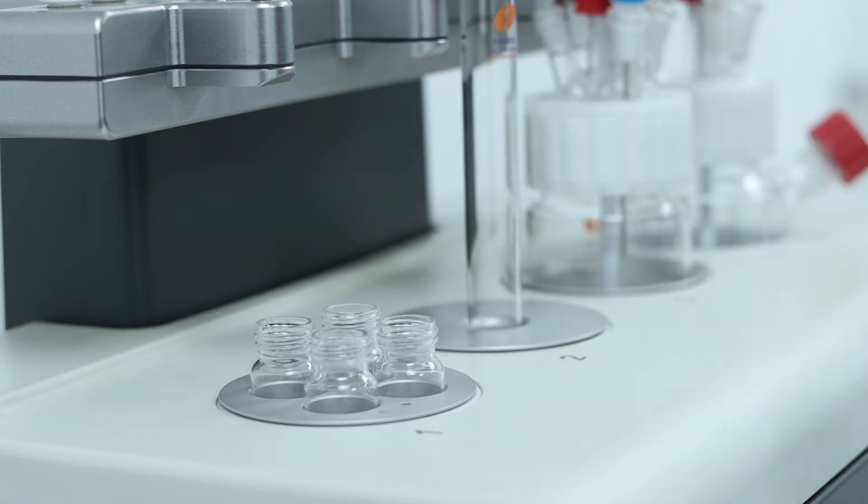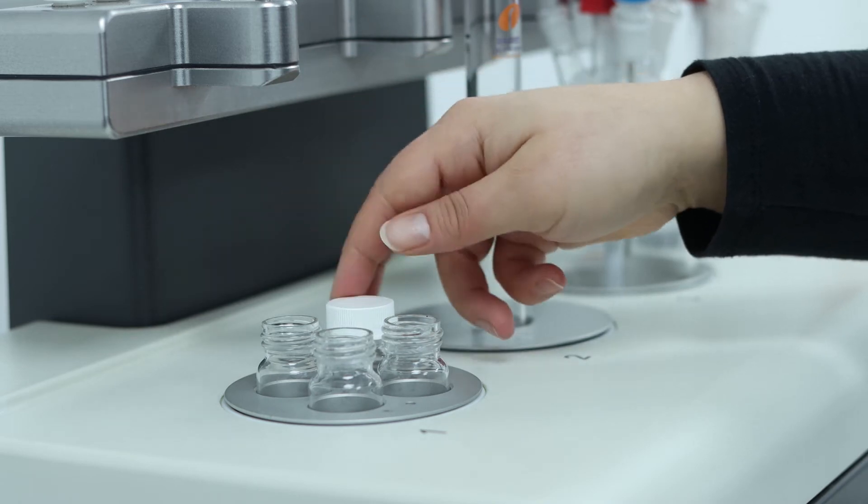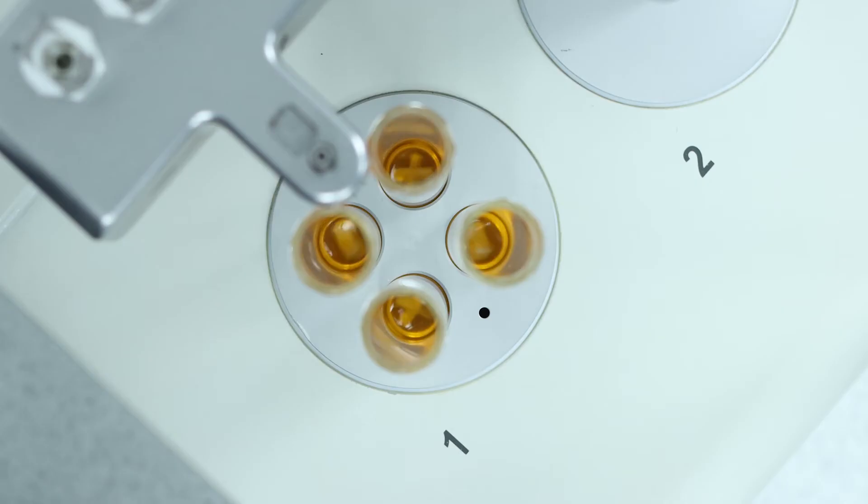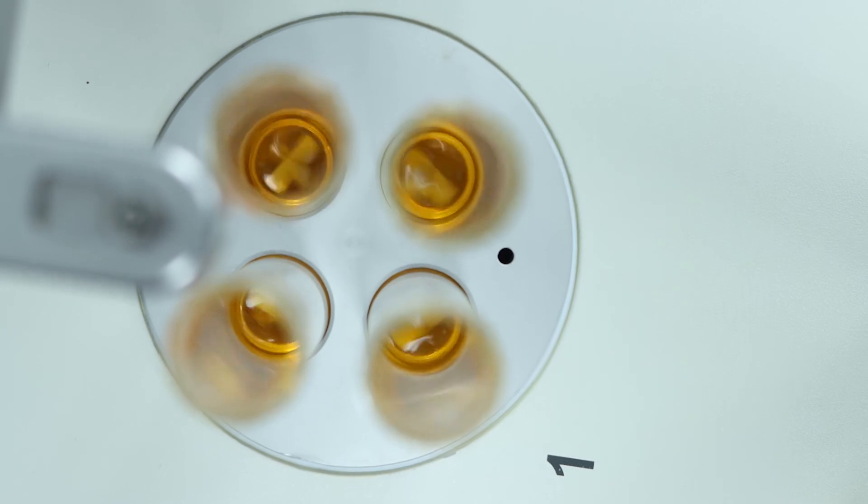Add the recommended stirrer bars and caps if using. All the tubes or vials are now positioned in a circle at the same distance from the magnet in the center, which means the stirring will be the same in all positions.